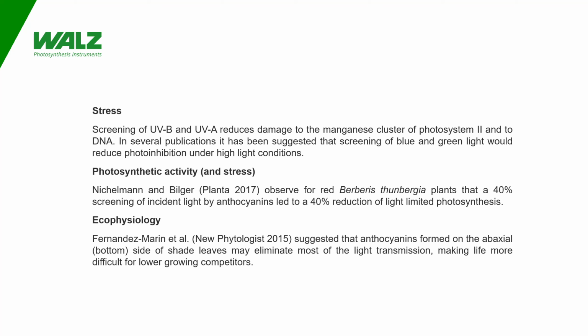Before continuing with the technical side of the screening measurements, let's first have a look at the processes for which screening may be important. As mentioned already above, UVB and UVA screening are important for the protection of DNA and the manganese cluster of photosystem 2. The screening of blue and green light may reduce photoinhibition under high light conditions.